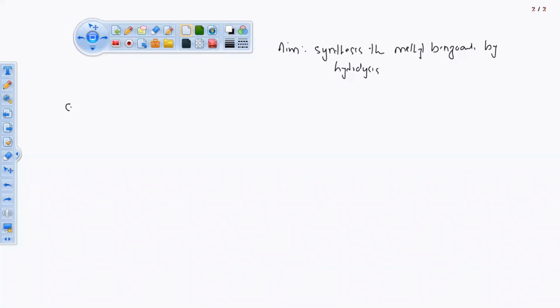Now the general reaction: apparatus क्या चाहिए हम लोगों को इसके लिए, apparatus what we required in our lab. We required the RB flask, and next we required the burner, condenser, glass rod, pipette, सारा सब कुछ जो भी चाहिए इसको बनाने के लिए, that all the apparatus we need. All those apparatus I'm going to mention in the soft copy, but we required general reaction.